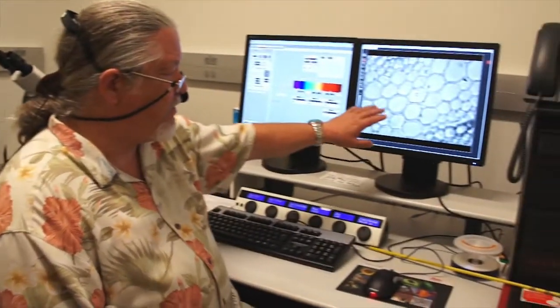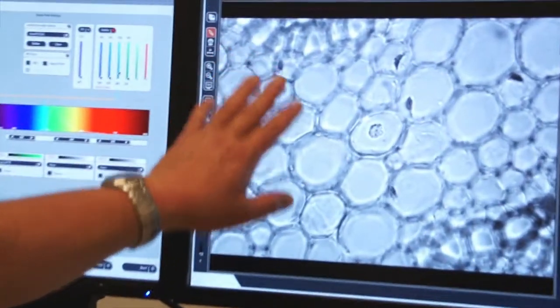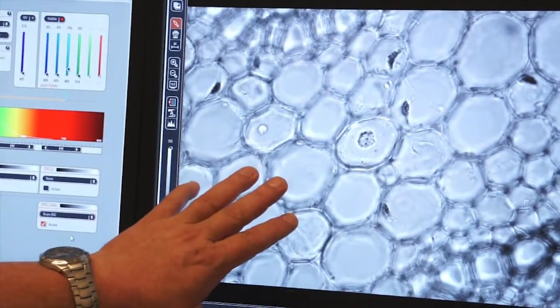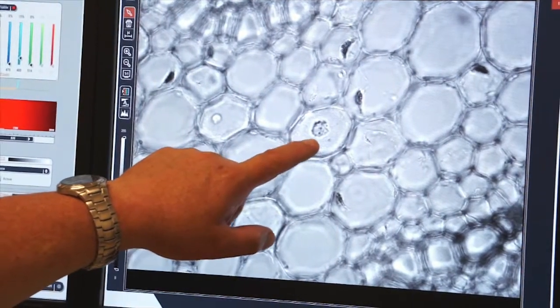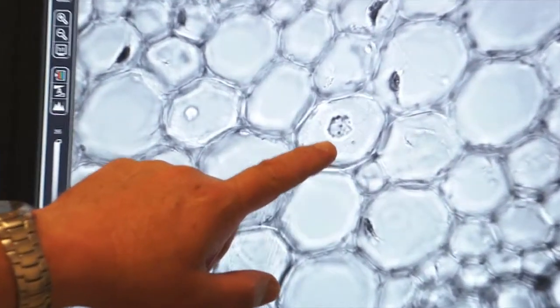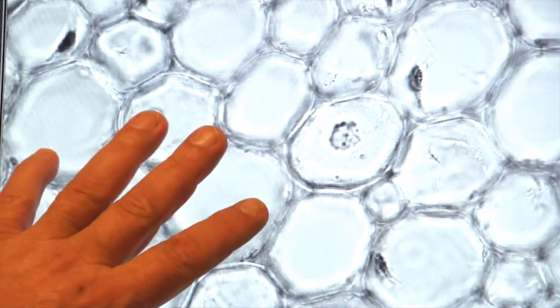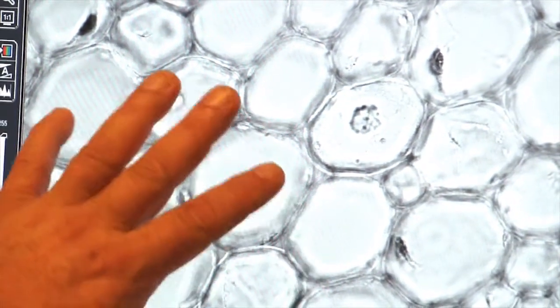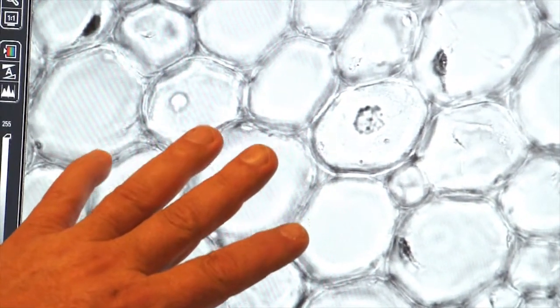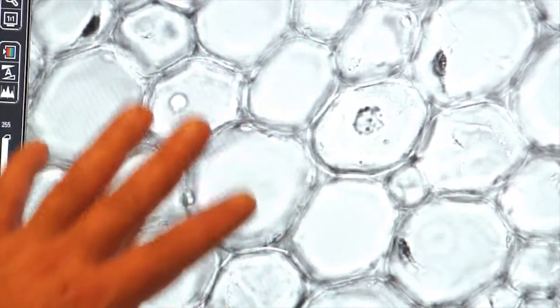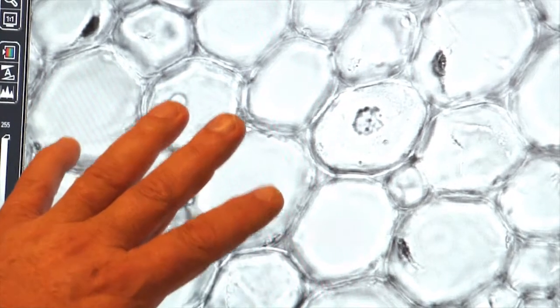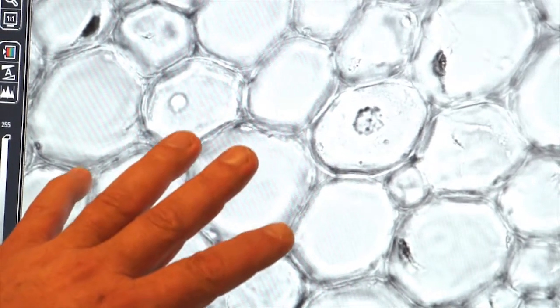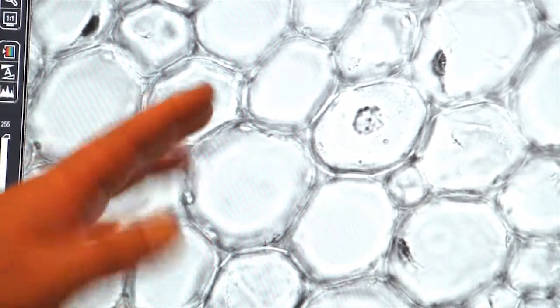You see an image — this is a bright field image of a thin section of plant material. You can see the individual cells, and inside one of these cells you see the nucleus. In bright field, it's fairly well illuminated. However, bright field sometimes lacks contrast. So bright field is one method of transmitted light illumination that you will use, and the other is DIC, or differential interference contrast. I'm going to change some software tools here, and you will see the difference when we go to a DIC image.